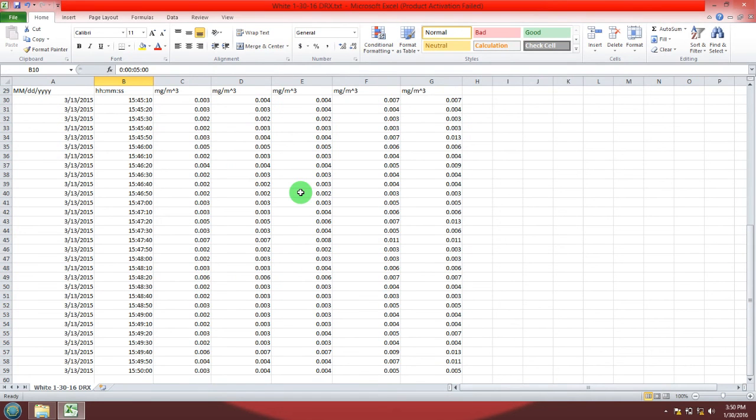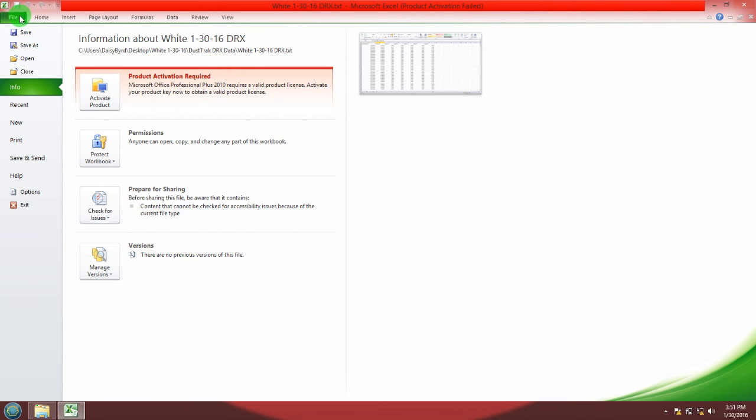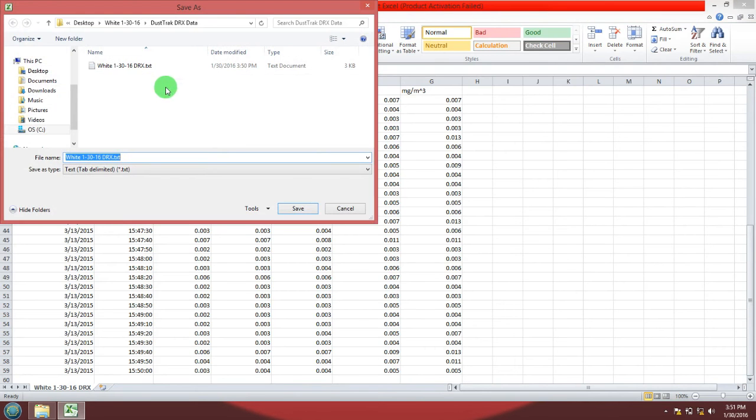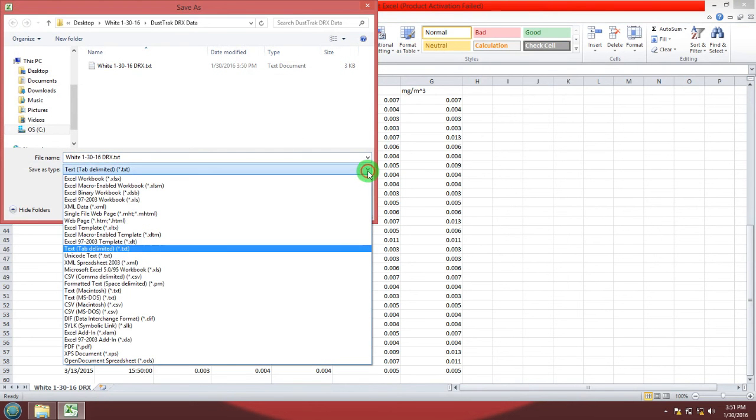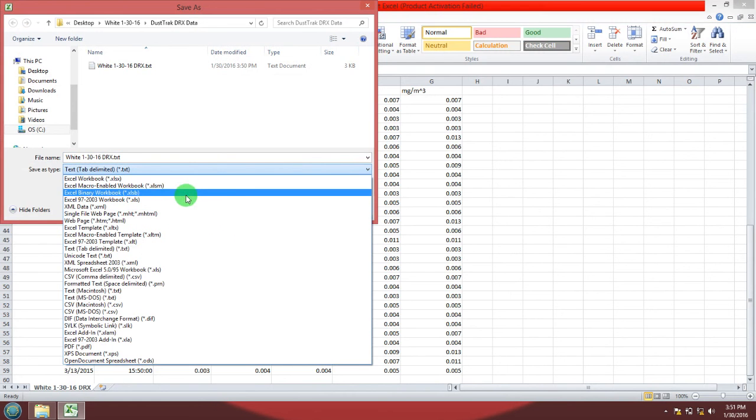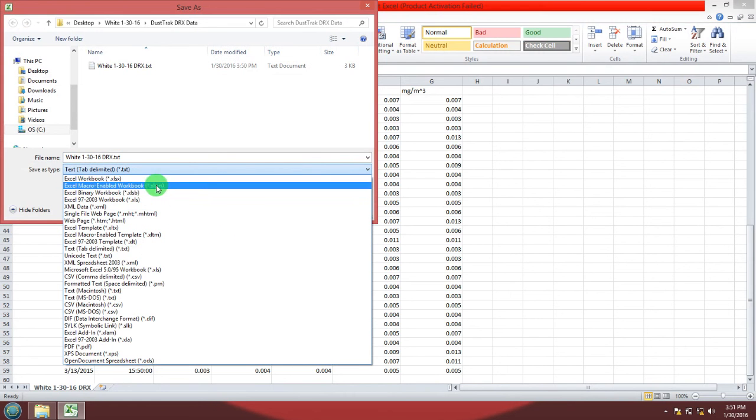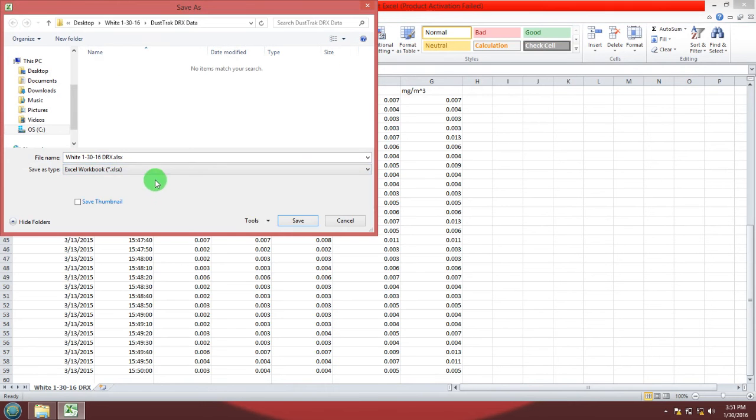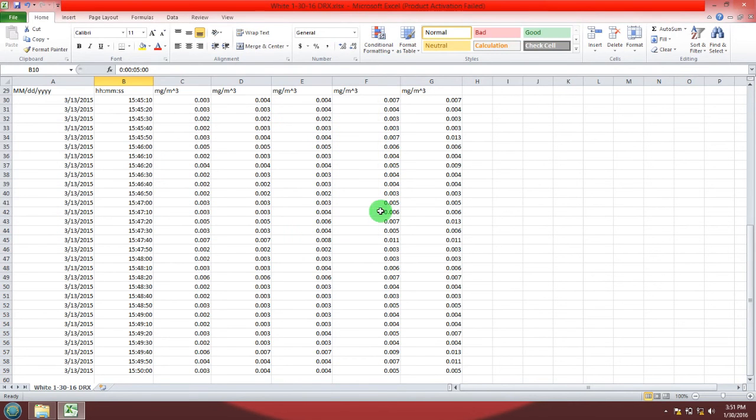Now you're going to need to save this data that has been imported as an Excel file. Go to file, save as, select the file type as Excel workbook or .xlsx or .xls. Hit save. Now you can close Excel.